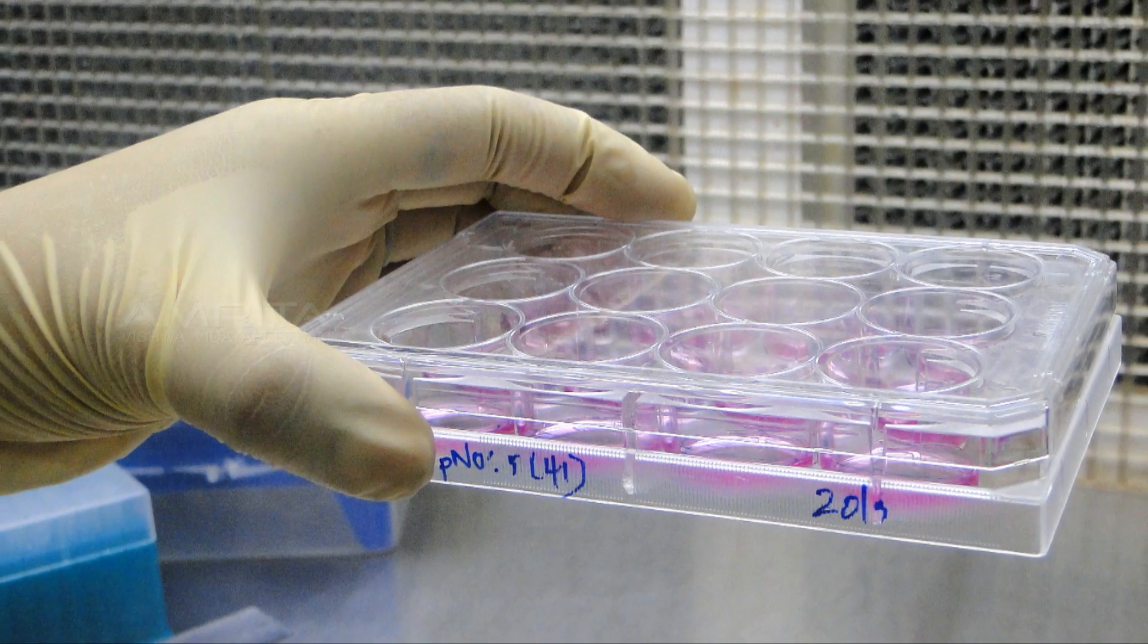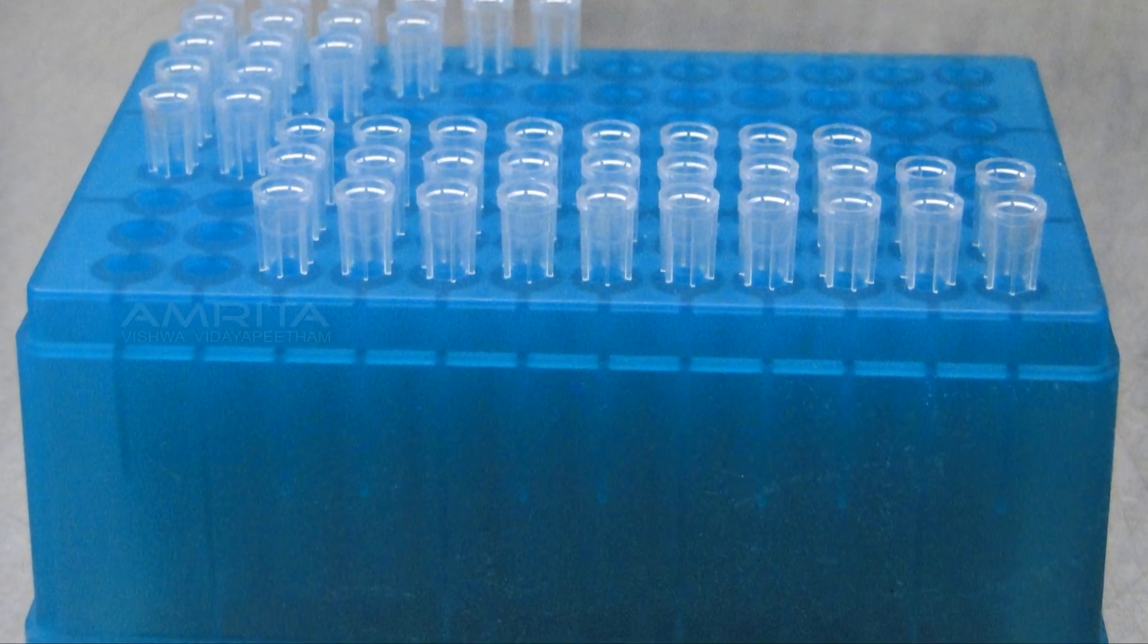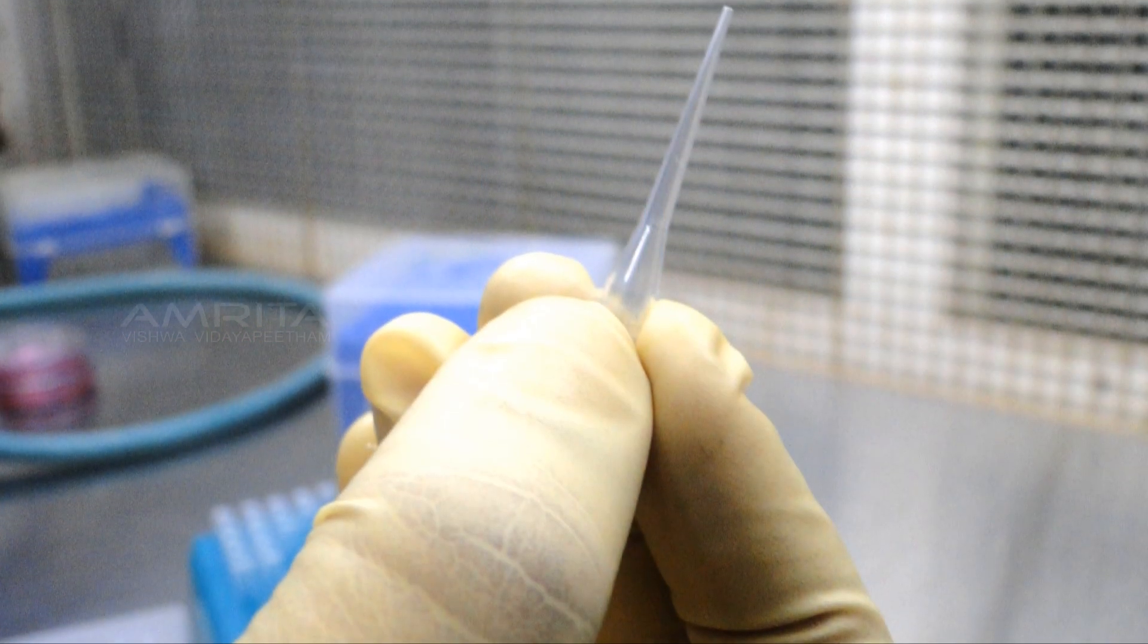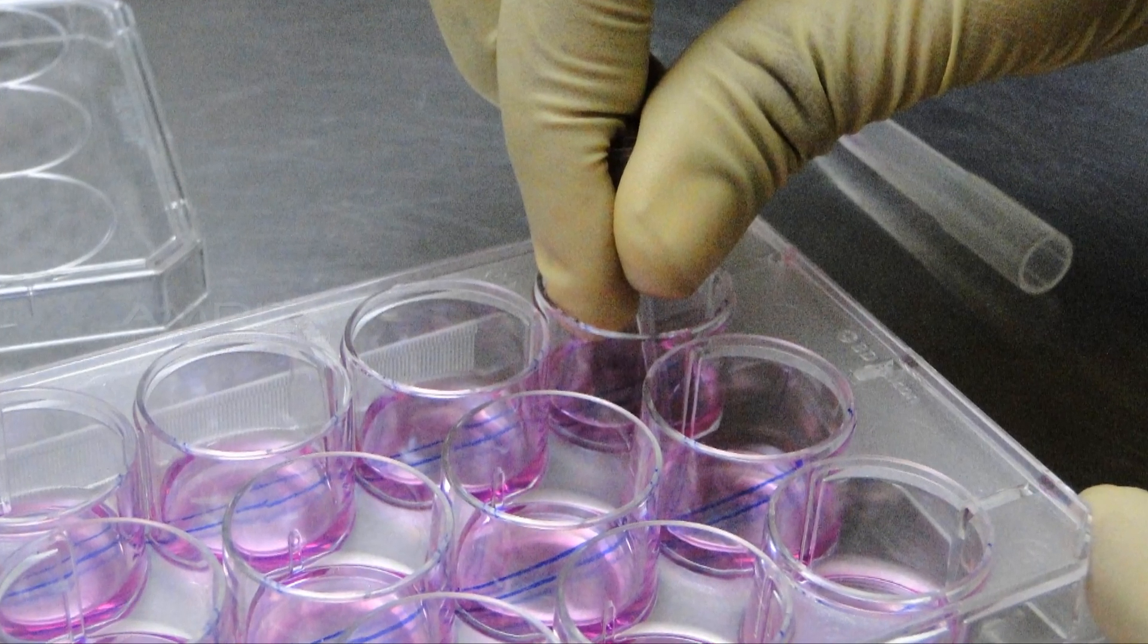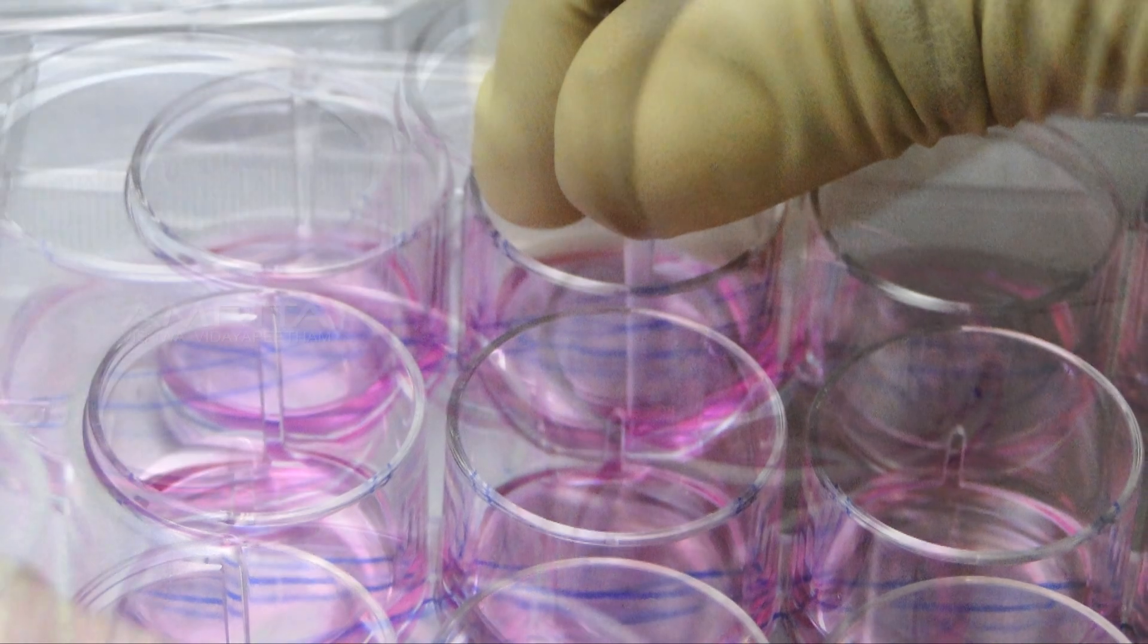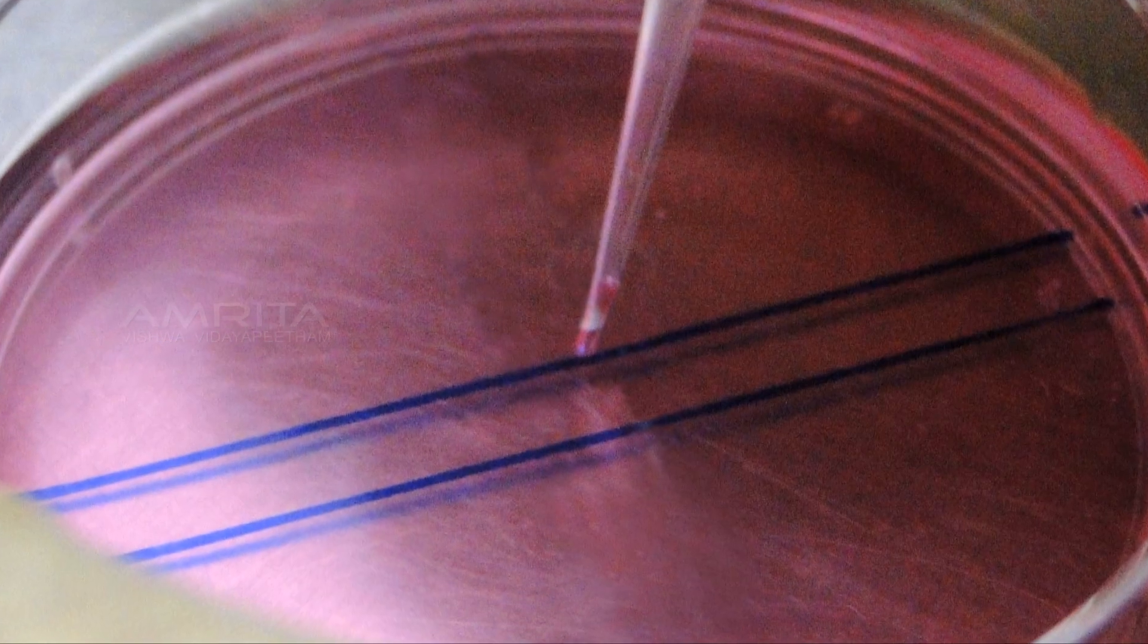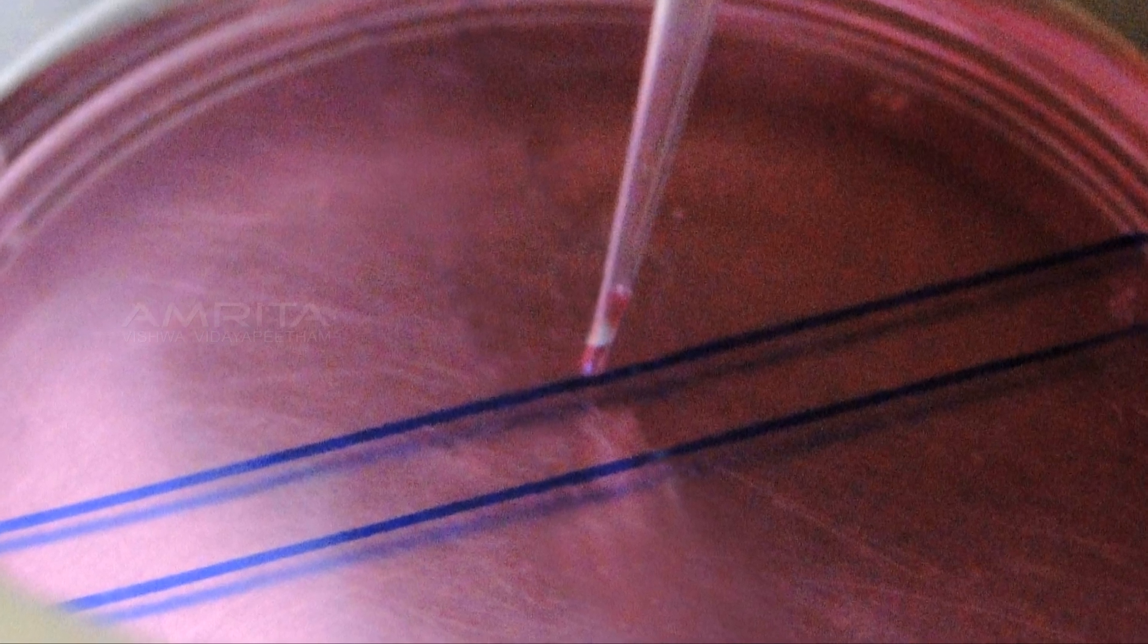Take the plate from the carbon dioxide incubator. Now take 200 microlitre micro pipette tip from the tip box. Make a scratch in each well by holding the micro pipette tip at the base of each well, slightly touching the base of the well and by dragging the pipette tip along the entire length of the well such that the scratch is perpendicular to horizontal line of the mark.